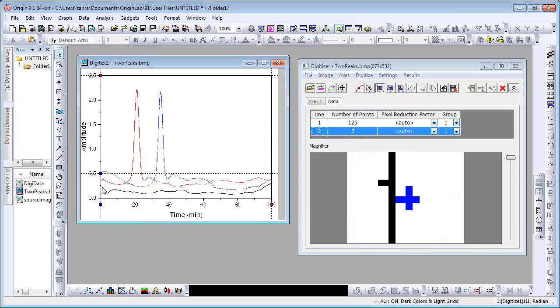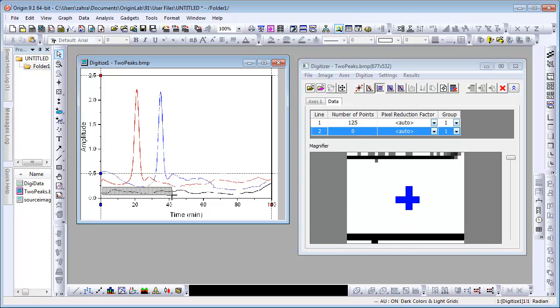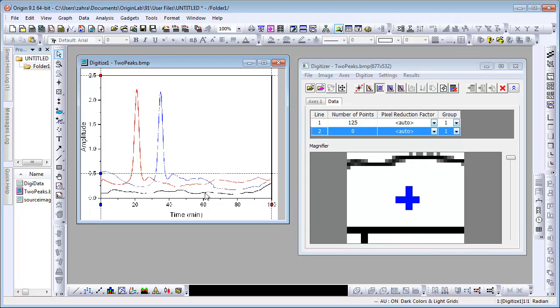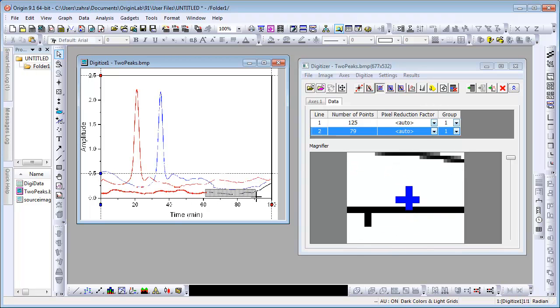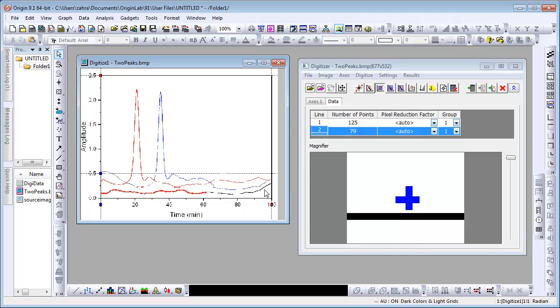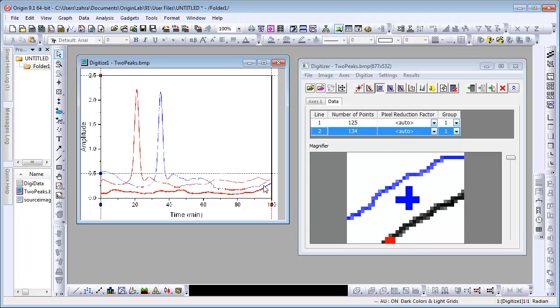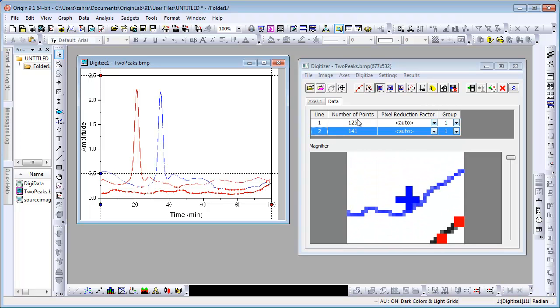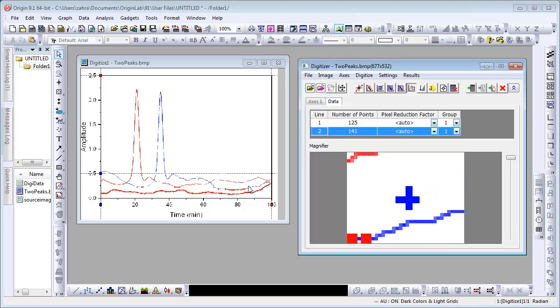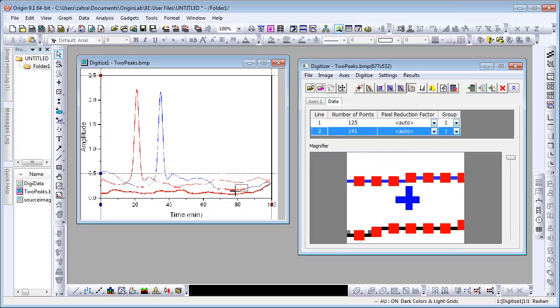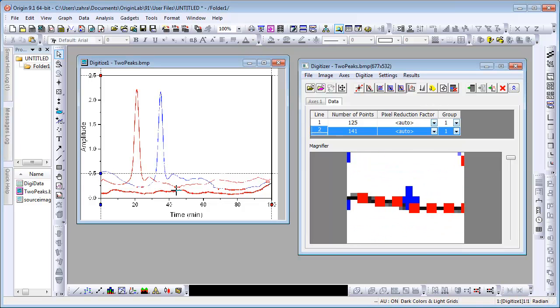As you will see, the density of the grid lines has increased which means more points will be captured, as points are captured wherever the grid lines intersect with the image curve. Use the Delete Lines button to delete the points we inadvertently captured on the other curves.